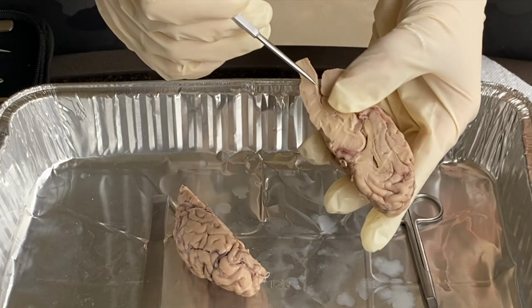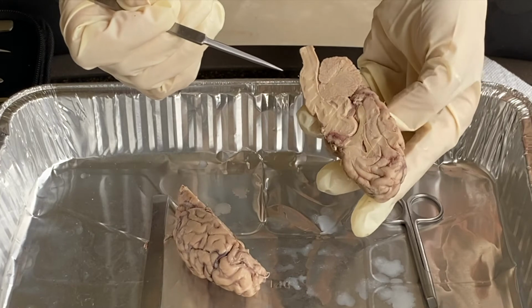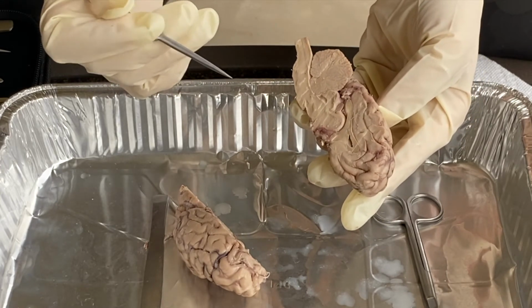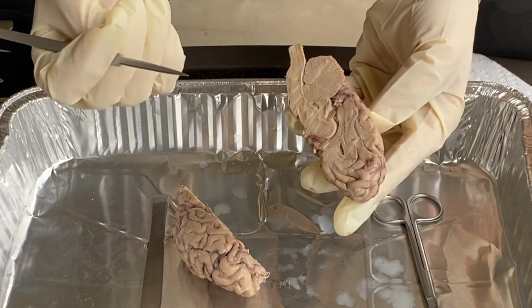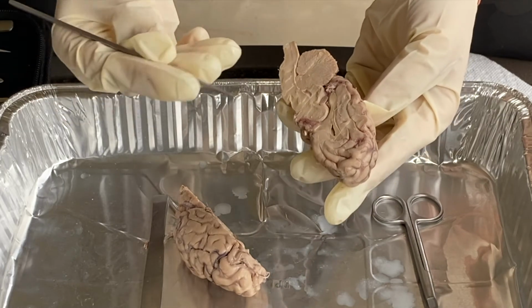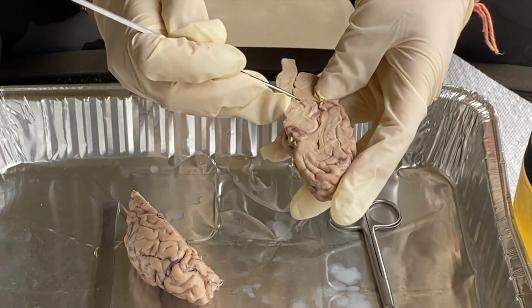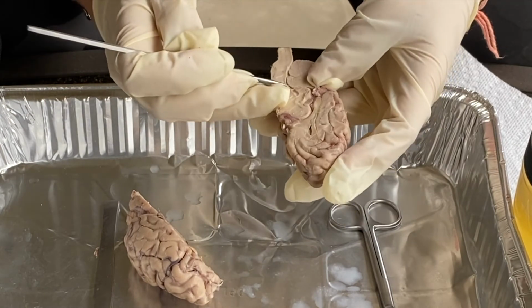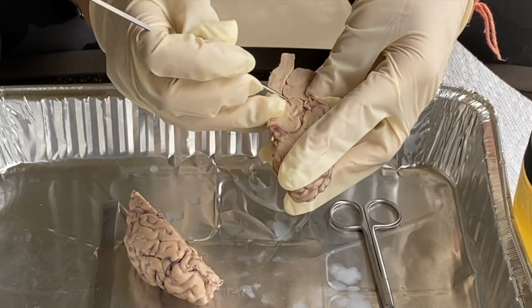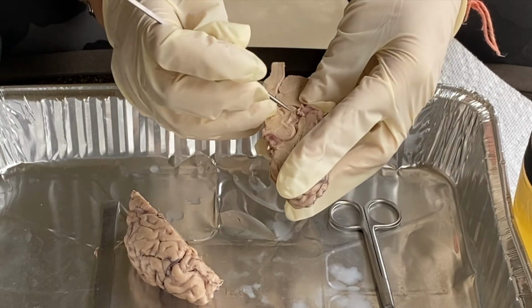Under here is your 4th ventricle, and the 4th ventricle also contains choroid plexus cells that are responsible for producing CSF, and again they protect the brain from injury and transport nutrients and waste. It is connected to the 3rd ventricle by the cerebral aqueduct. So this is where the cerebral aqueduct is right here, and it's a very narrow kind of tubing and duct that allows the fluid to flow from the 4th ventricle here all the way to the 3rd one right here.